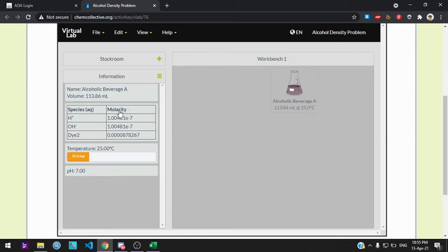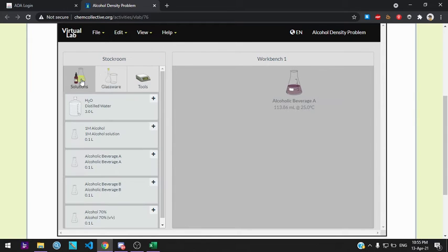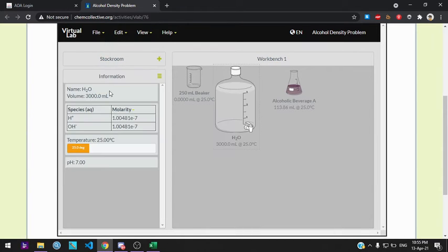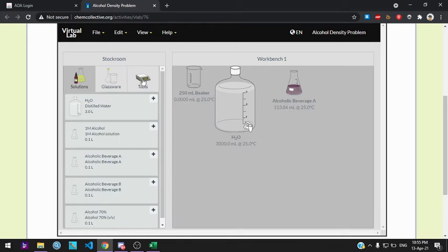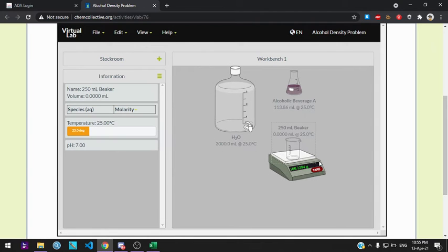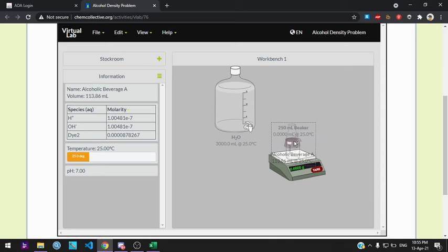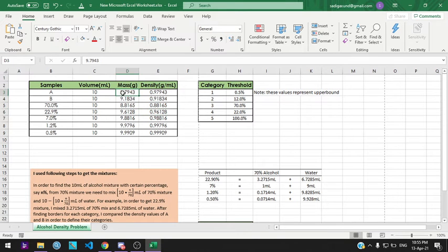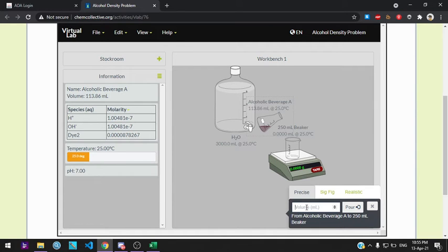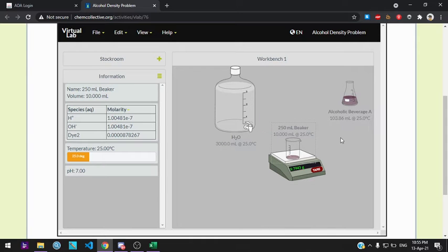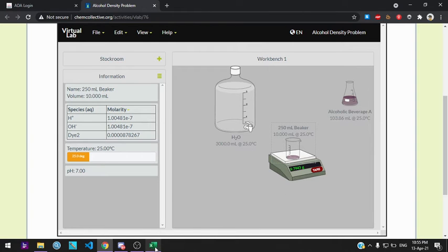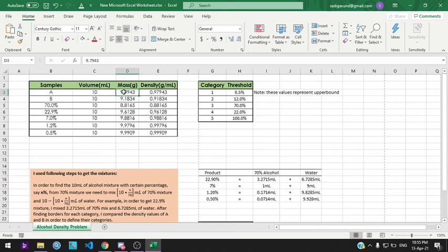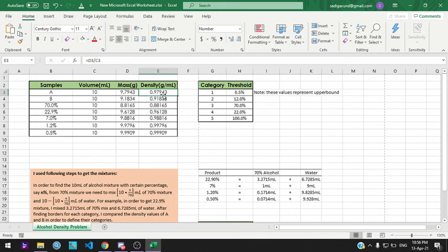Beverage A. We need some beakers, water, and scale. It gives us 9.79 approximately grams of beverage A. Recorded to the Excel data sheet, which gives us 0.97943.